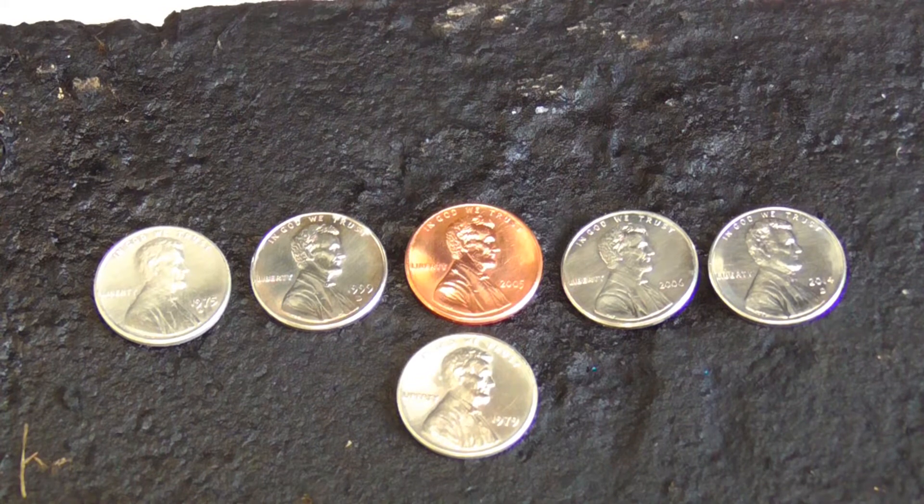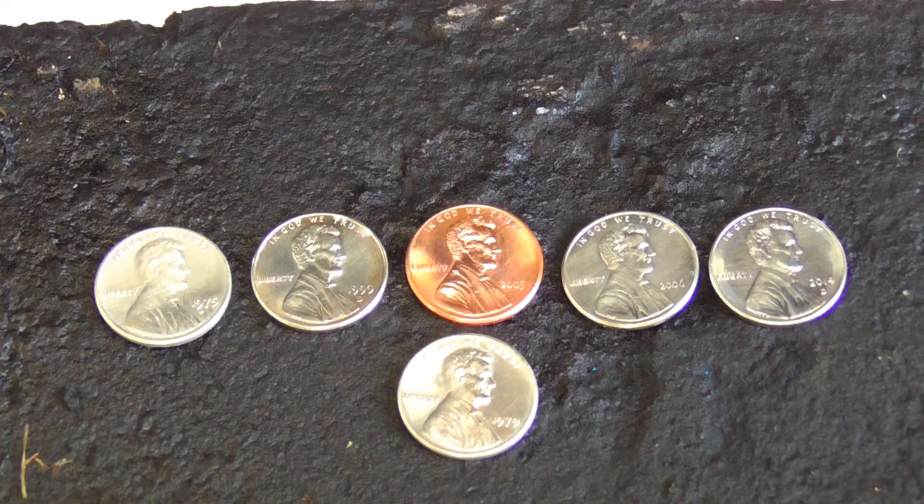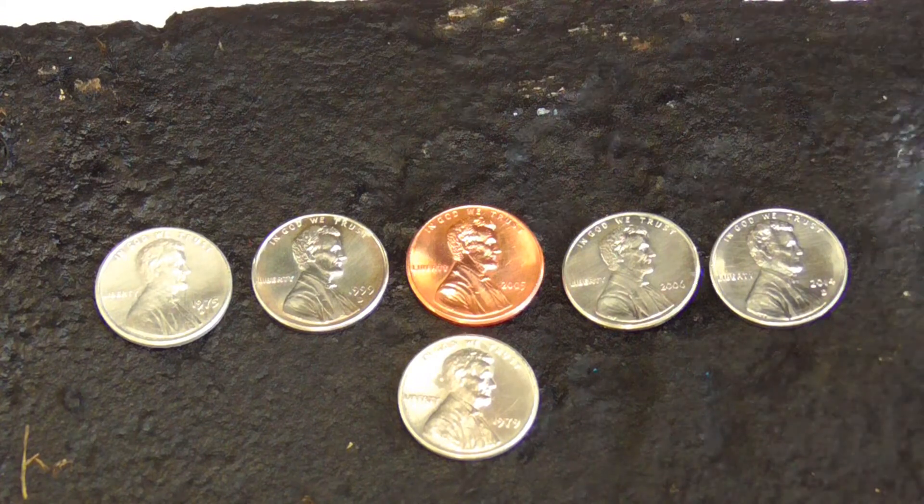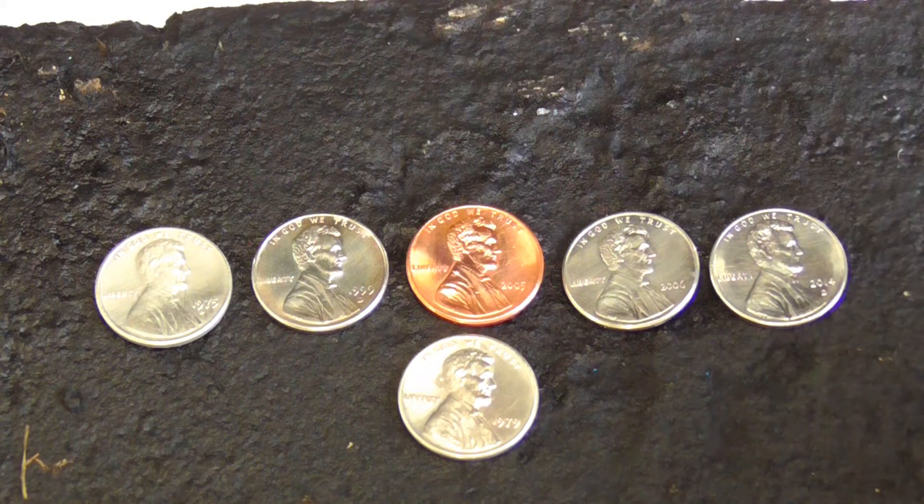In a previous video, I showed how to coat pennies with zinc. This also gives a silver colored coat, but the coat of zinc wears off in just a few weeks. On the other hand, this tin coat should last for several years.